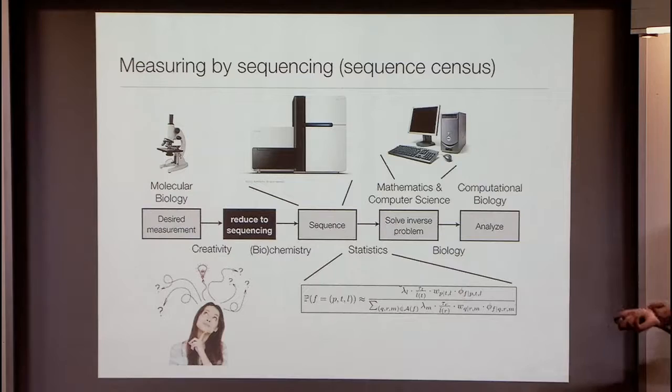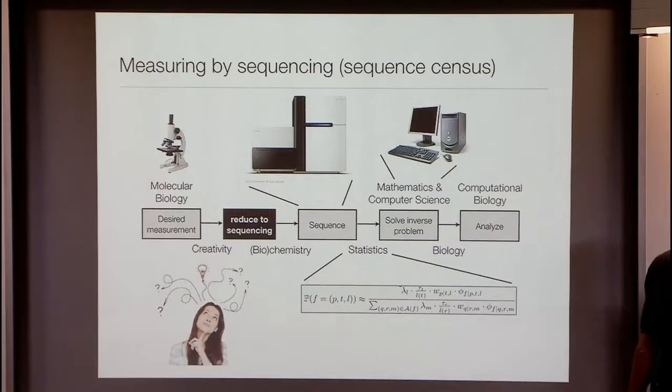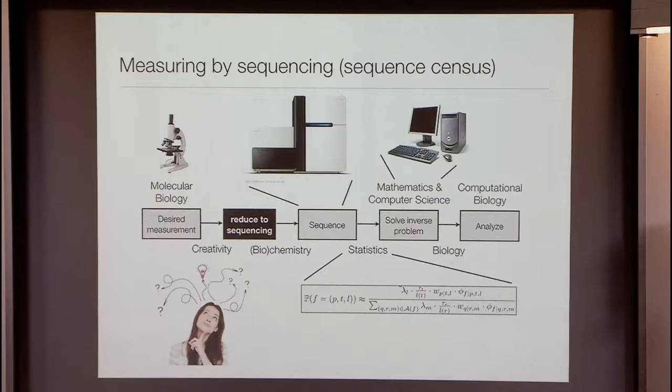So what is the singular assay of this kind that's most widely used and therefore has become the dominant application of DNA sequencing and read alignment? It is prenatal testing. Starting about 2 or 3 years ago, maybe a bit more, people started looking at the application of the fact that there's fetal DNA in the plasma of mothers while they're pregnant, and therefore by sequencing DNA from the plasma and counting read alignments to chromosome 21 specifically, you could figure out whether the fetus has trisomy 21 or Down syndrome.